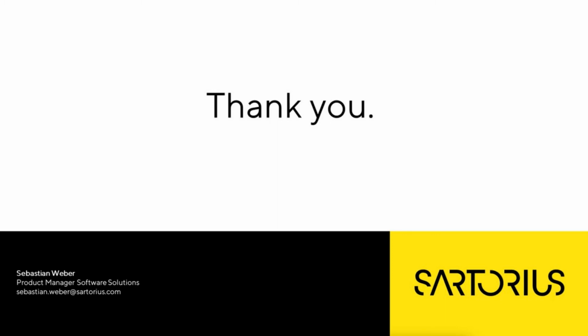Great, thank you. All right, this next question asks, how many users can be created on the balance? Okay. To be honest with you, there isn't actually a limit on the number of users to be created on the balance. Obviously, the facility to have corporate directory, Active Directory control on the balance does help with this.